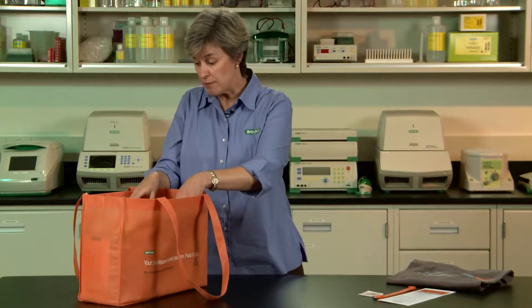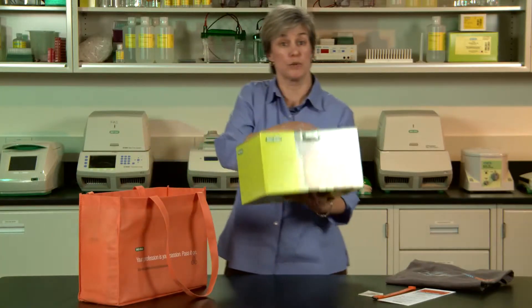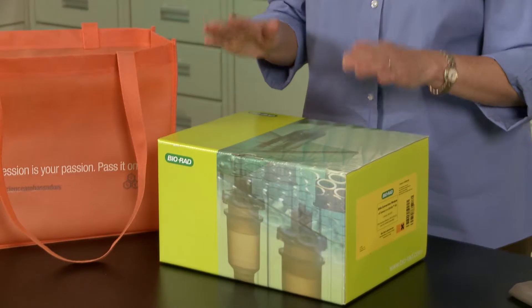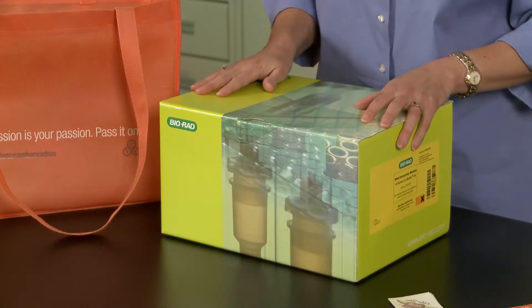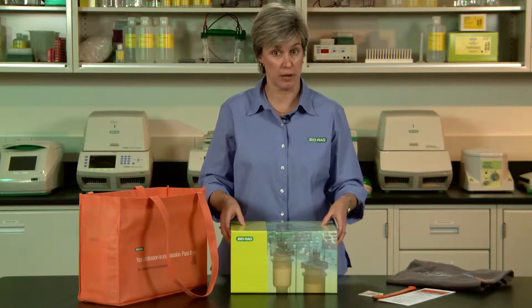The next part we have is actually the Genes in a Bottle kit, and this is the activity you will be doing with students. There's one large box — this has the instruction manual, which is great. It has some great background information for you in terms of why we do DNA extraction and what it means to students. All of the plastics and the reagents you're going to need for the day are also in here.